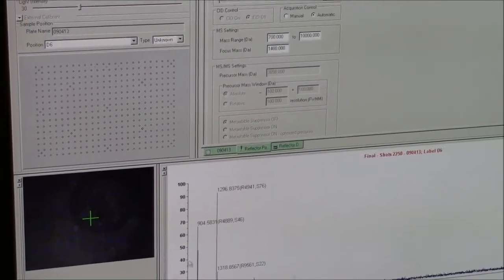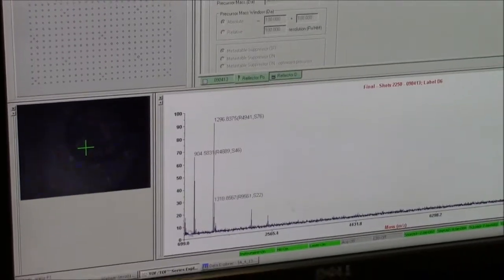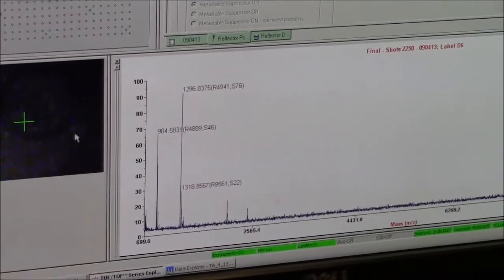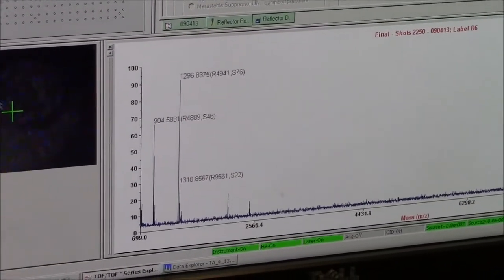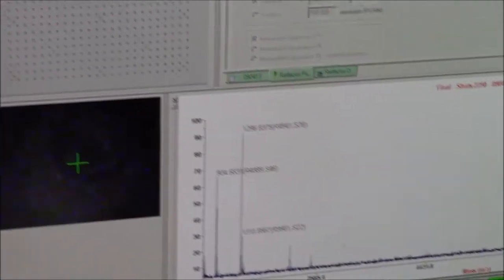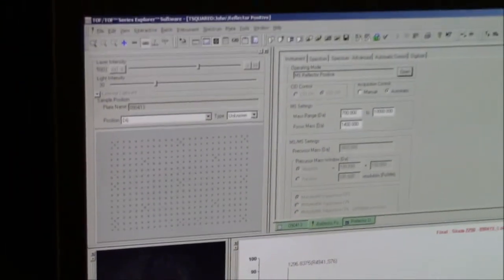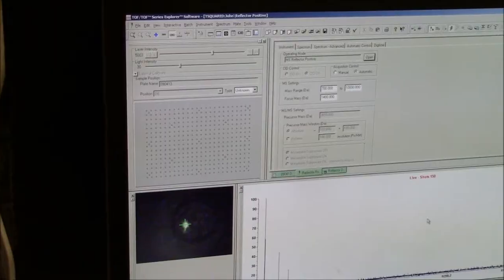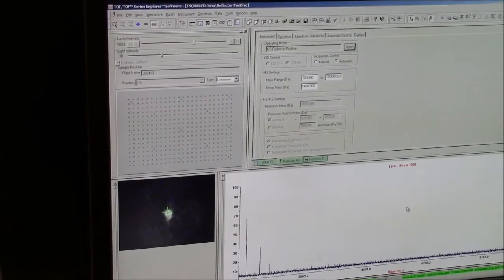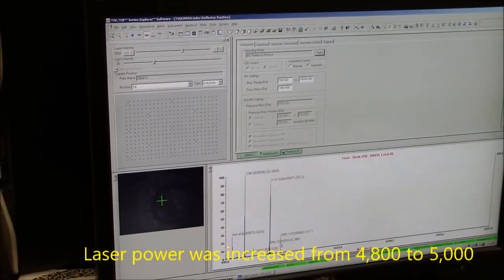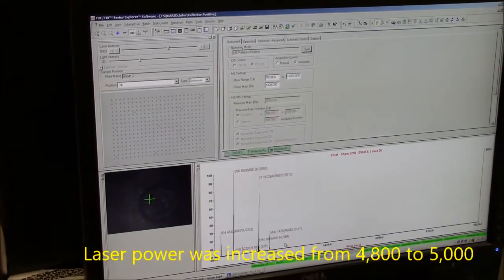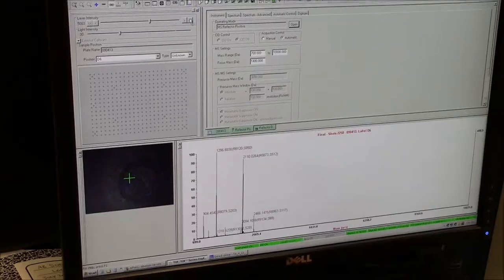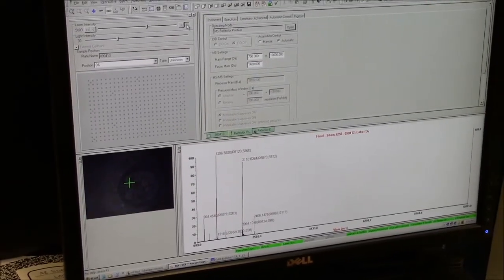So we spotted a set of standards that go all the way out to 3,000. But you're only seeing standards that go up to about 2,000. So that means that you're just not quite using enough laser power. So this button will go up 100 laser power at a time. So let's go up 200 laser power and shoot another area. That all of a sudden showed me some really high-res data there, but it was kind of hot spotty. Some areas worked, some areas didn't work. So you're approaching the right laser power, but you're not quite there yet. So let's go up another 200.